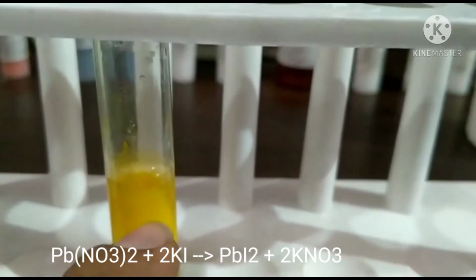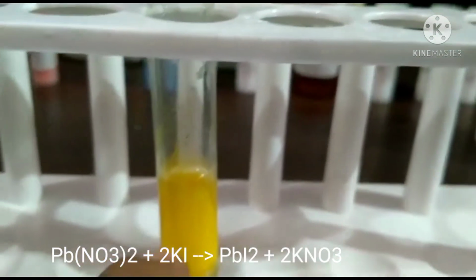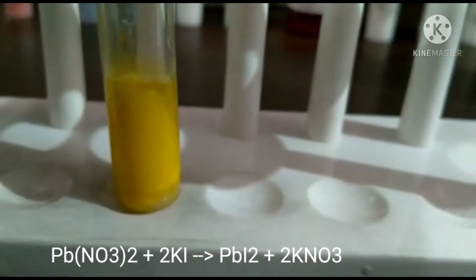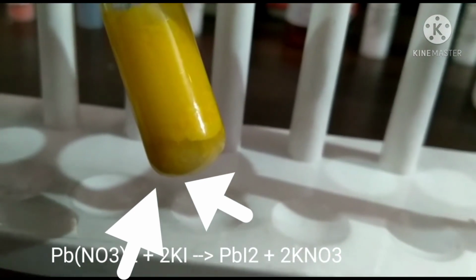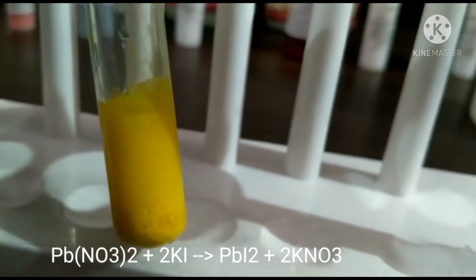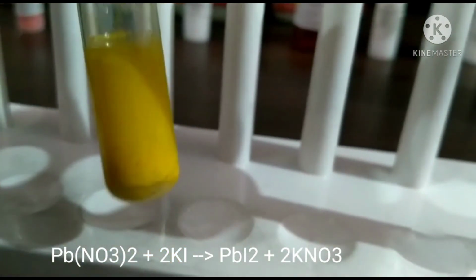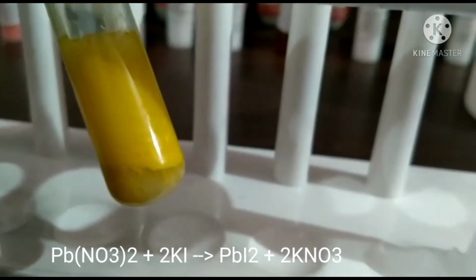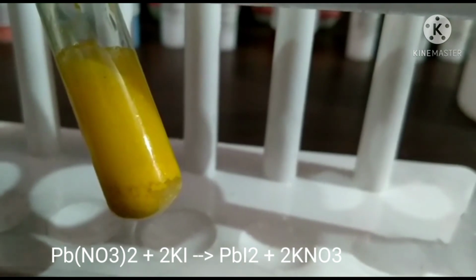Potassium nitrate is white, but because of the lead iodide, the solution is appearing yellowish. At the bottom here you can see the formation of lead iodide, and above there is a white compound called potassium nitrate. This is a double displacement reaction that leads to the formation of a yellow PPT.